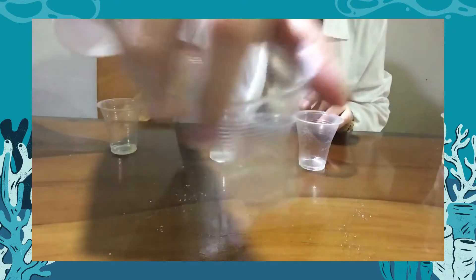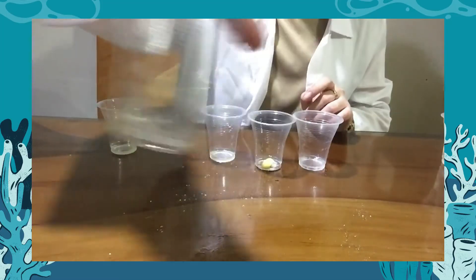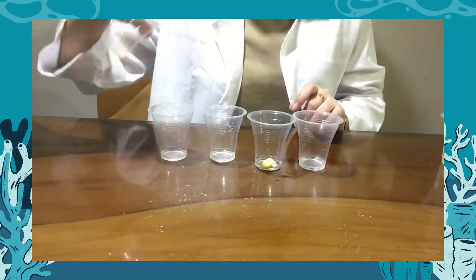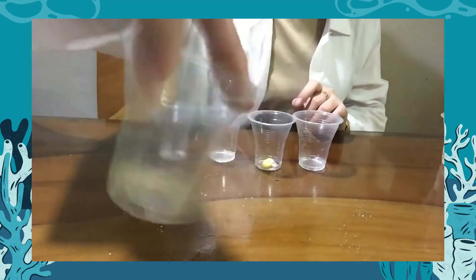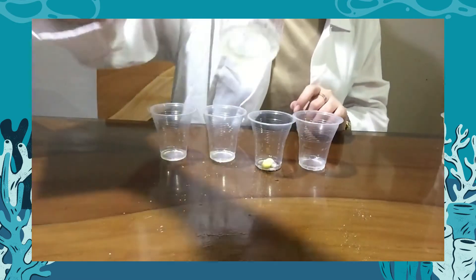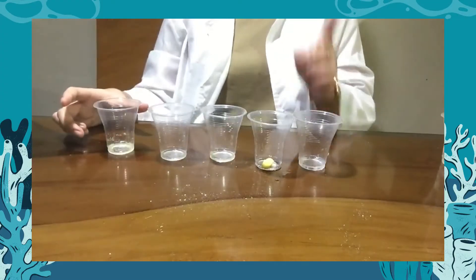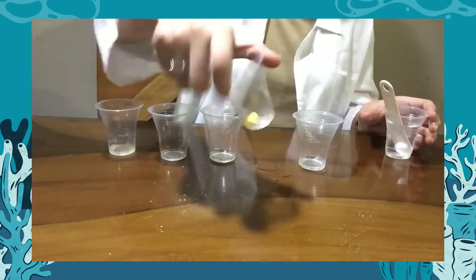The next one is sugar with water. After shaking, it dissolved just like the sodium chloride with water — it also dissolved in 1 ml of water. The next one is gelatin powder with water. After shaking, we observed that it needs an additional 1 ml of water.